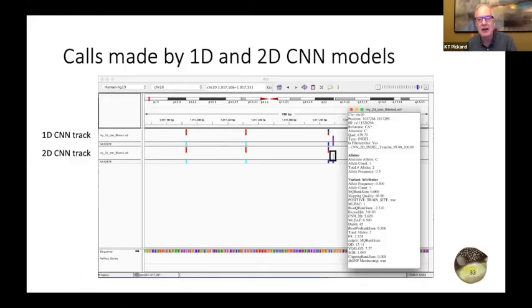The output is similar. Here you can see that we've got the same sample. Indeed, the indel is still filtered out using the 2D convolutional neural network model. But the take home from this is in this slide where on the top track you'll see the 1D model and the bottom is the 2D model. This is a difference between the two models. The reason that it's a little dimmer is that it's called differently between those two models. It gives us a reasonable starting point. I've had a lot of fun over the last week playing with these different tools.